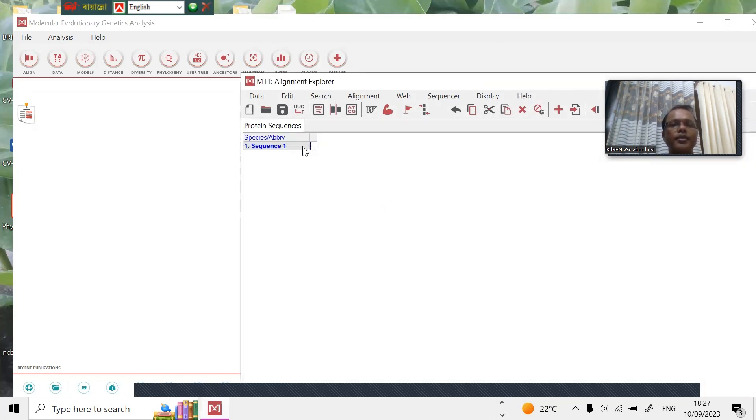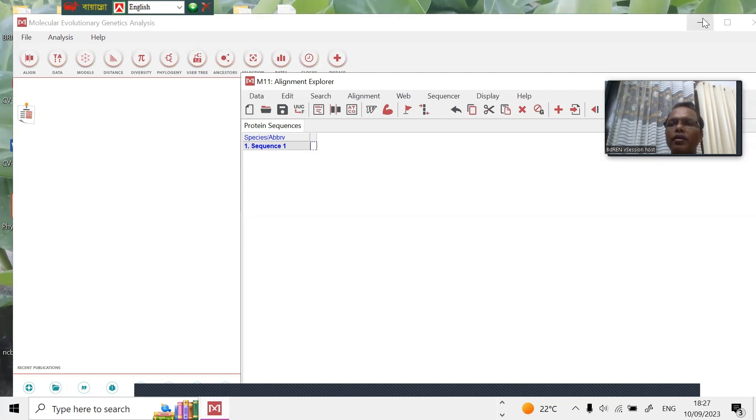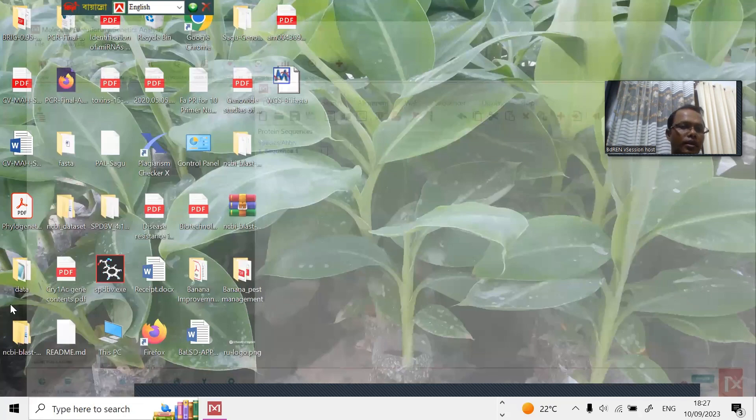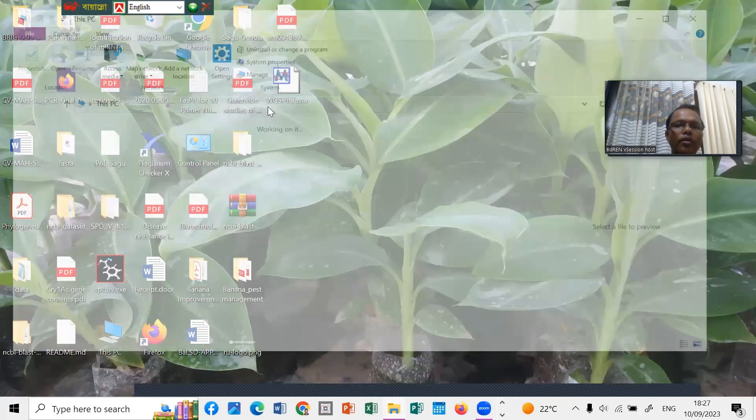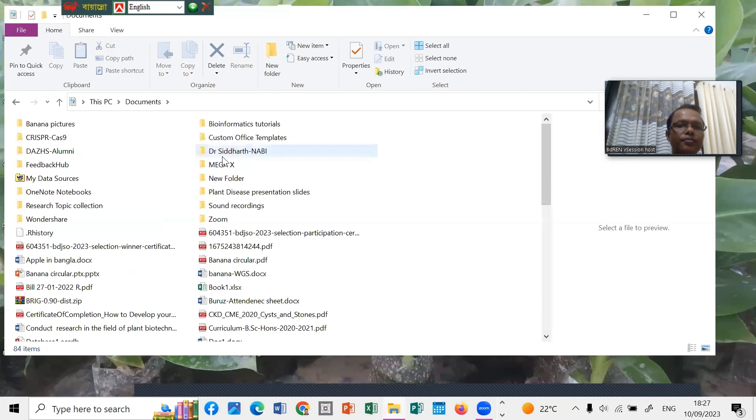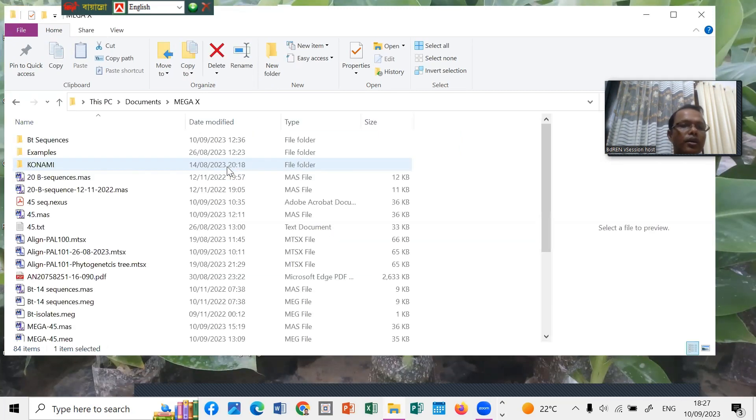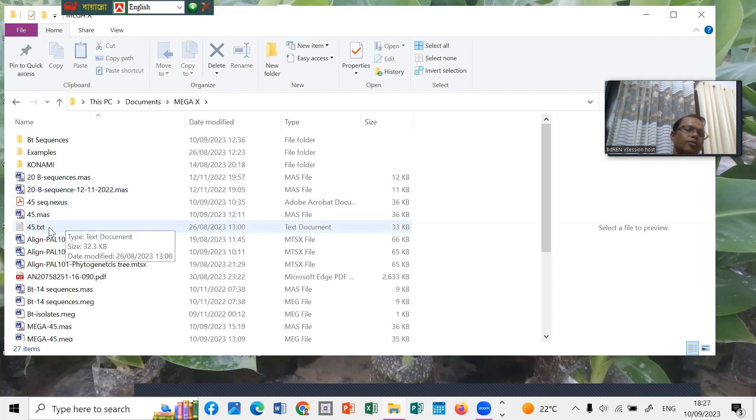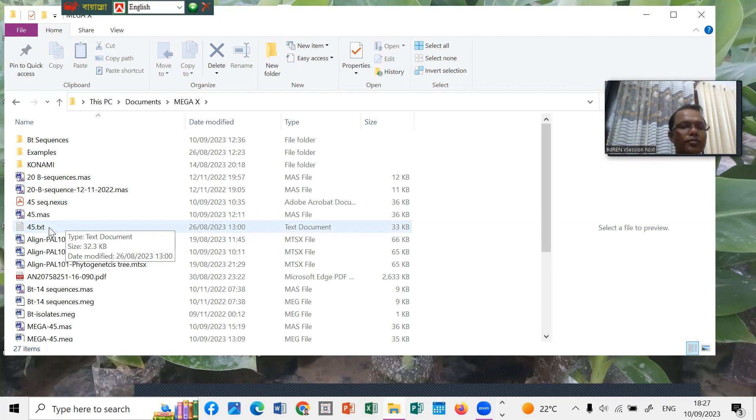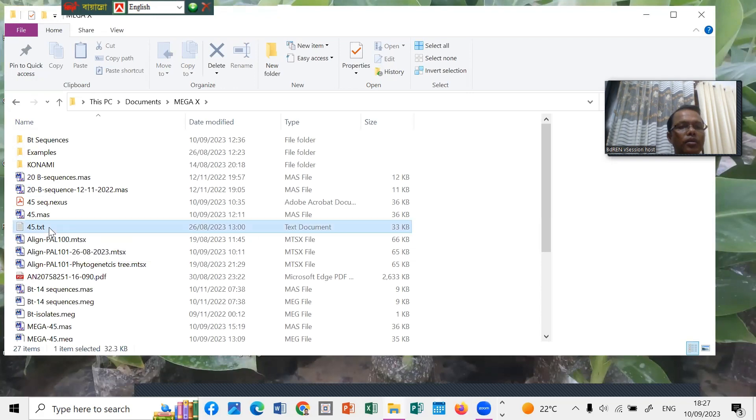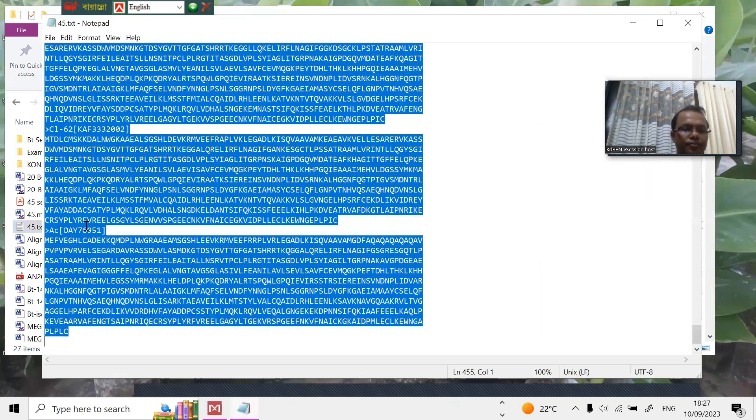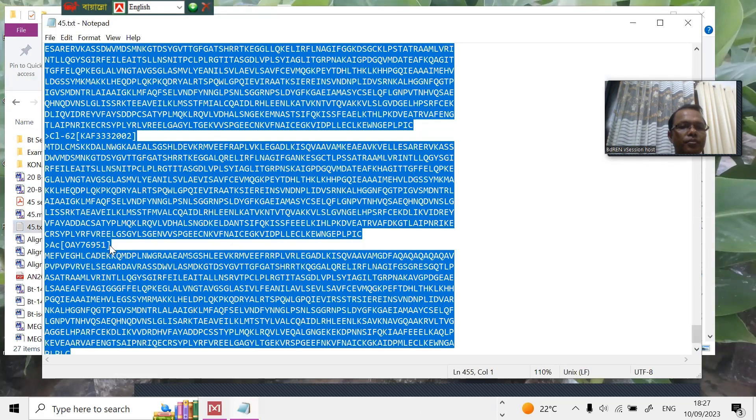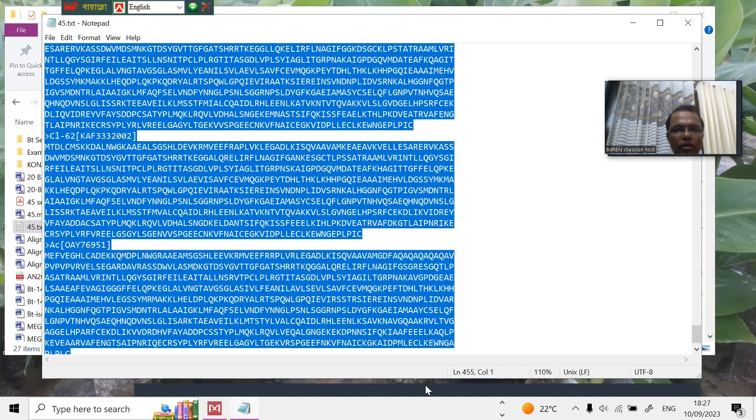Now we have to open the file. I have the file here, you can see phylogenetics MEGA. I have 45 sequences, we discarded some files. This is 45. From here I can copy. You can see the copy, and edit and paste.